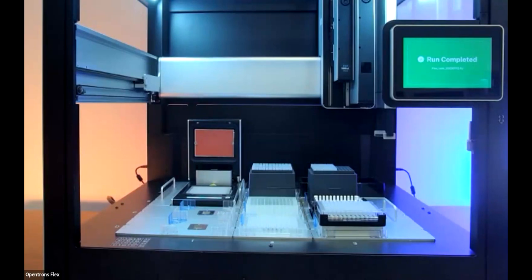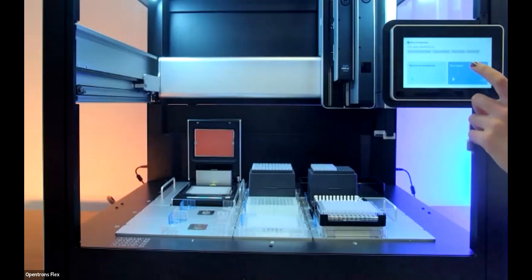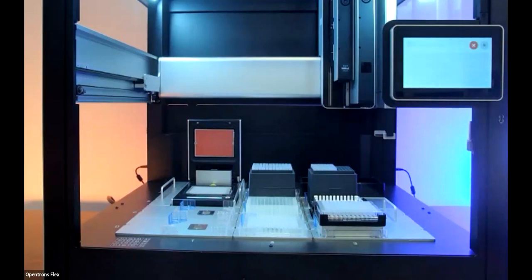As for the next question, I actually can demo that on the screen. So if we go back to the protocol. Jesse, maybe just read the question because I don't think that everyone else can read it. Okay, interesting. Great. So the question is, is there a load check for the labware, whether it is present or not, and also whether it is the correct one as specified within the protocol?